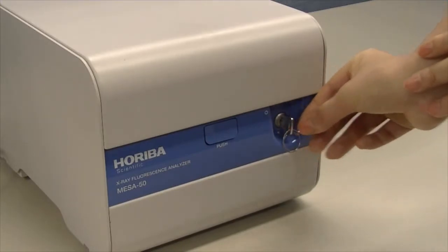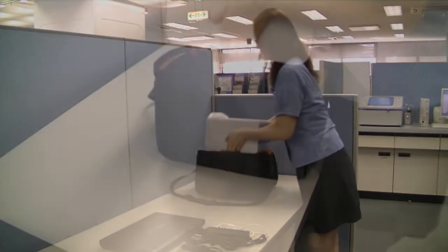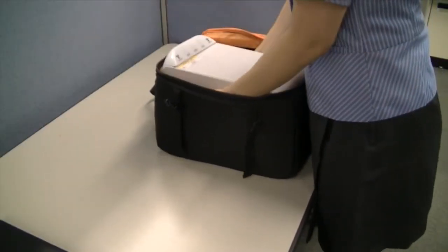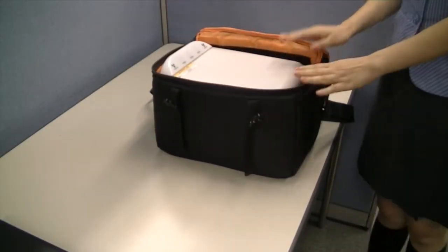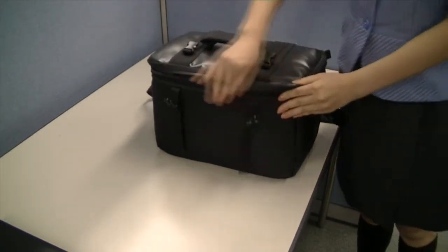The distinguishing feature of Mesa 50 is its small and compact design. The lightweight makes it transportable. A nice carrying case is available for easy handling as an option.